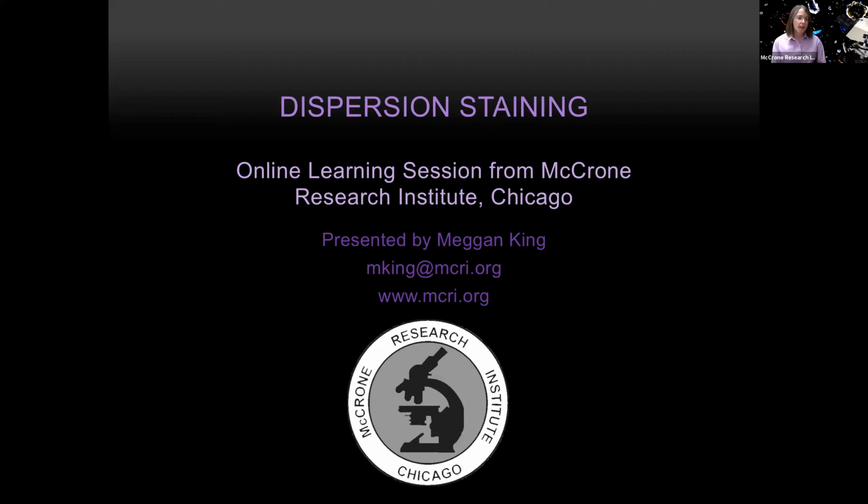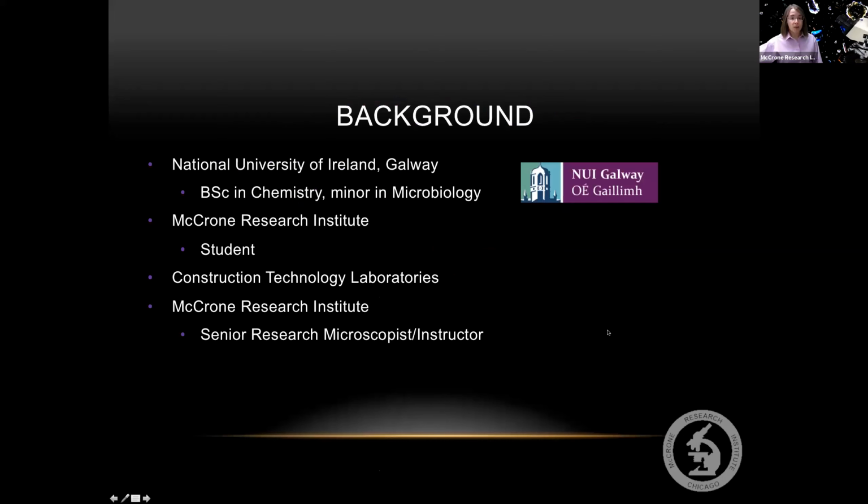Again, talking about dispersion staining today, and specifically we'll be dealing with traditional dispersion staining using a central stop dispersion staining objective. Just to get started with a little bit of background about me, I recognize some names. I've had some of you in class. I've met many of you at Intermicro.